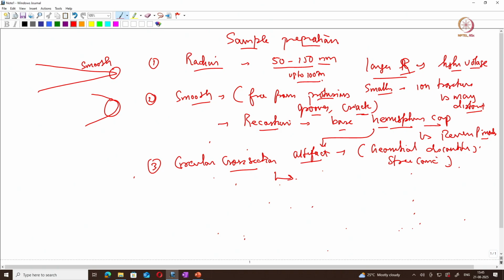But if it is not a circular cross section, it is possible that the electric field distribution is very erratic. This may lead to inhomogeneous field evaporation from the needle specimen. Then you will not exactly replicate the needle specimen during the reconstruction.